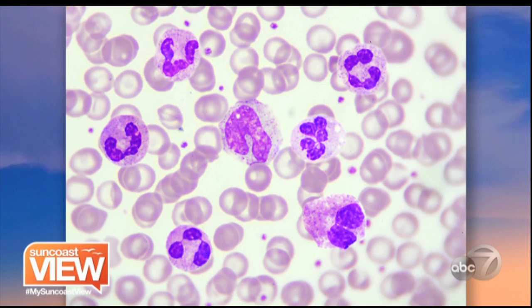But look at the white blood cells on there. You have the Pac-Man cells, the ones that look like little Pac-Man, right? So they're going in there and eating foreign bodies in the body. So funguses, parasites, molds, free radicals, cancer cells, dead bacteria, phytotoxins, endotoxins that your body's not really supposed to have. And we're always being bombarded in our environment by toxins, so xenoestrogens, phytoestrogens, so you rely on those white blood cells to go in there and fight your battle. And your body shows all of this. It shows all of it.